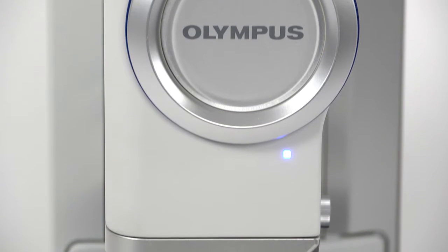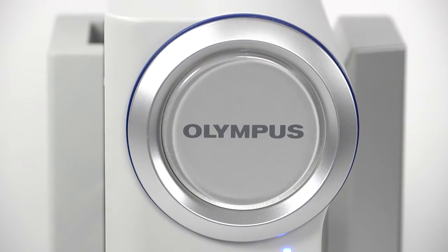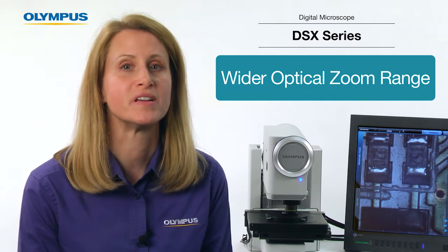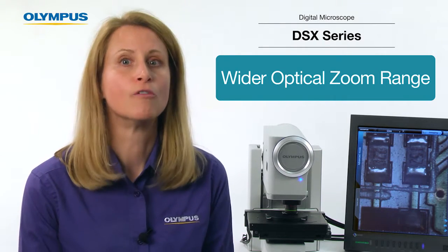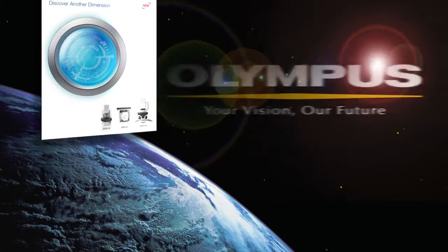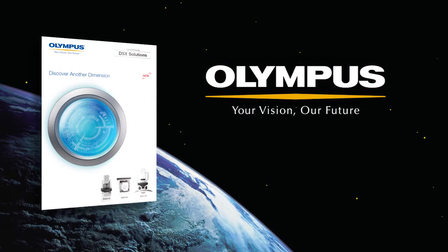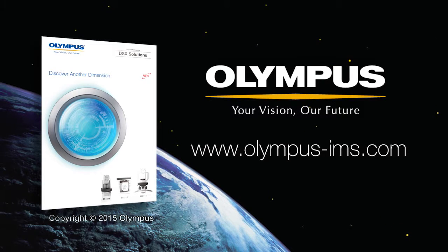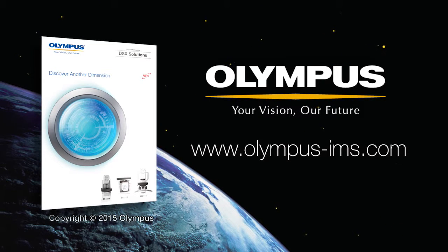Olympus is proud to offer the largest zoom range of any digital microscope on the market. So when you're considering a new digital microscope, pay close attention to the optical zoom ratio of the system to give you the largest magnification range without compromising image quality. For more information on Olympus DSX digital microscopes, contact your local representative or visit us online at www.olympus-ims.com.